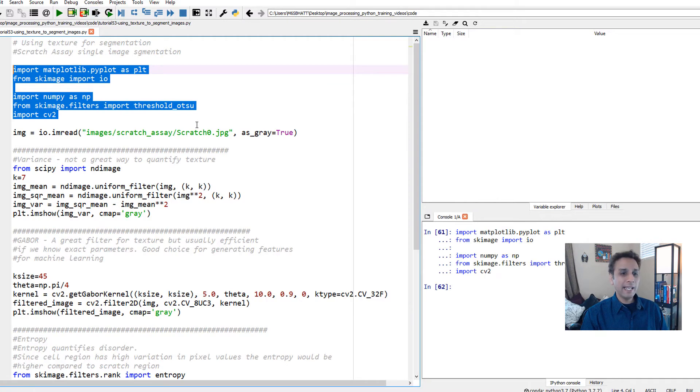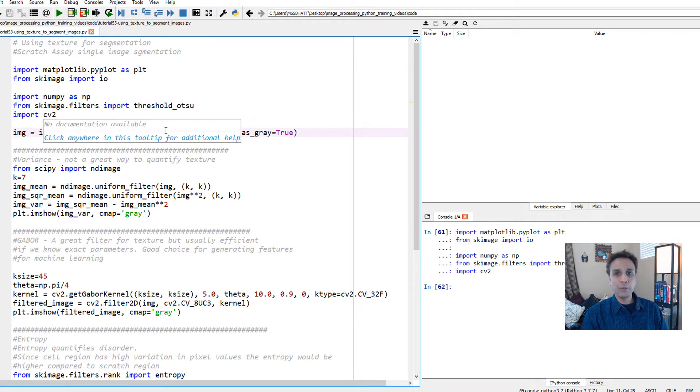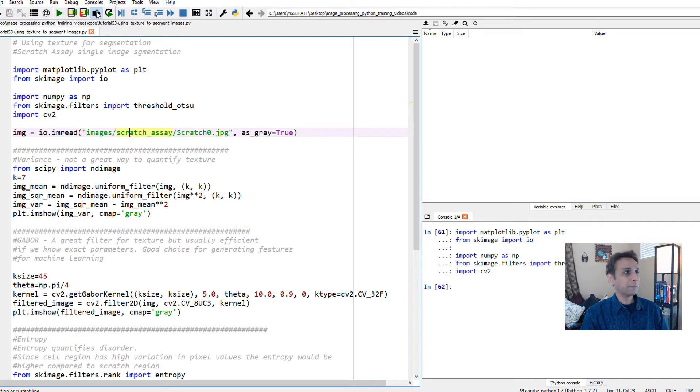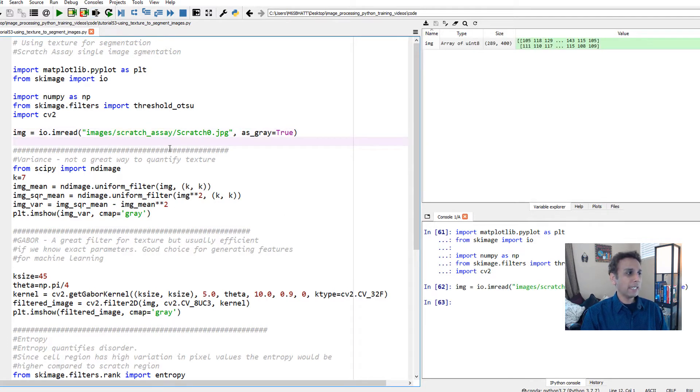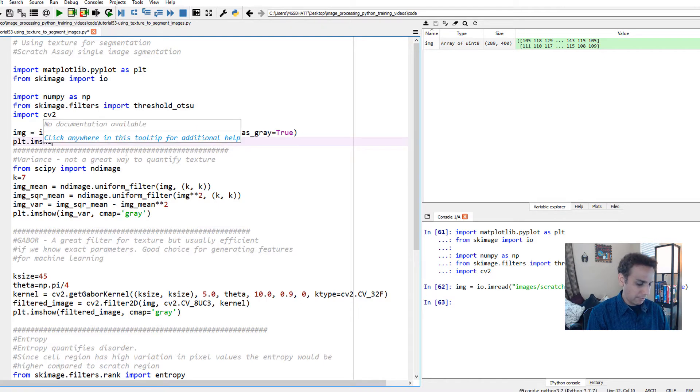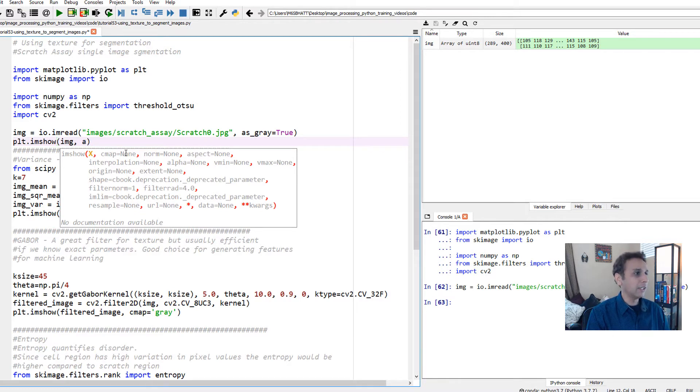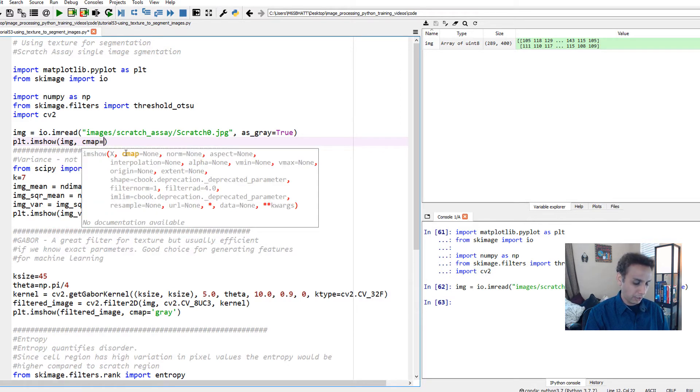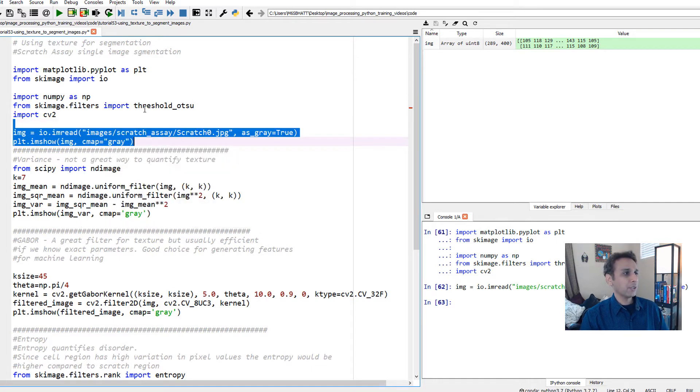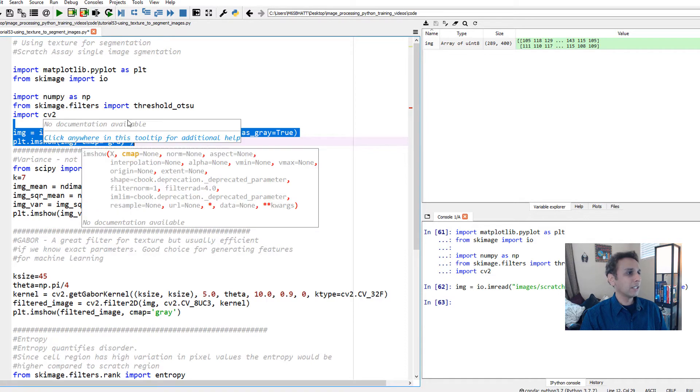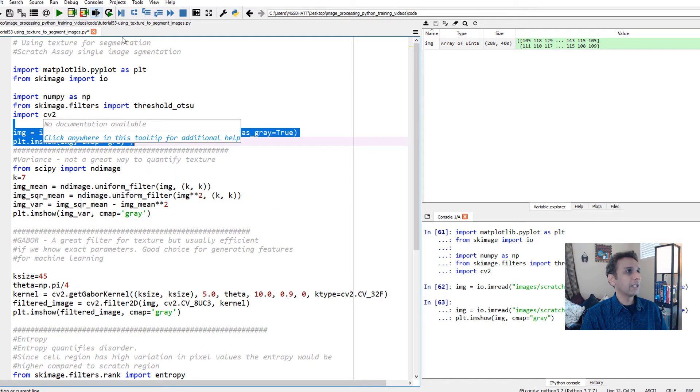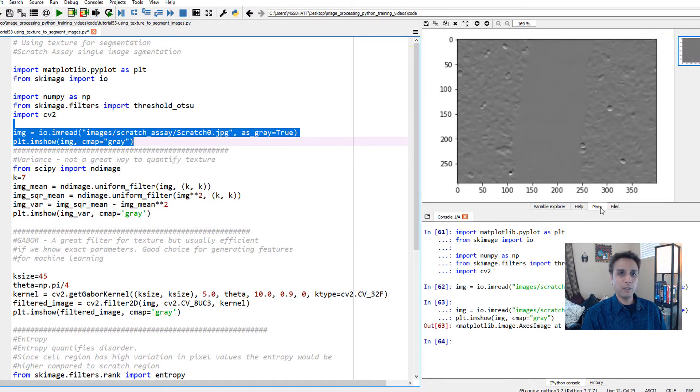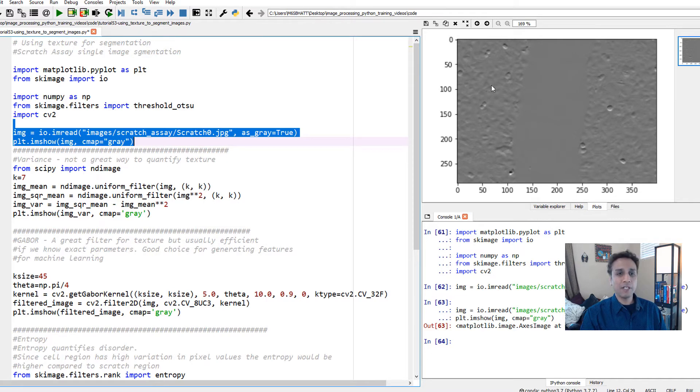Let's import the image we're trying to segment or apply our texture filter onto. This is our image. If you look at plt.imshow with cmap equals gray, let's plot this image. Let's run this. If I go to plot, this is the same image. This is the input image.